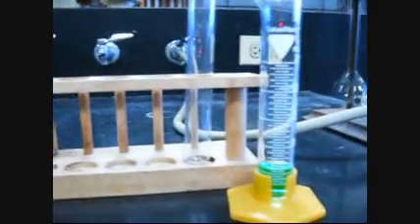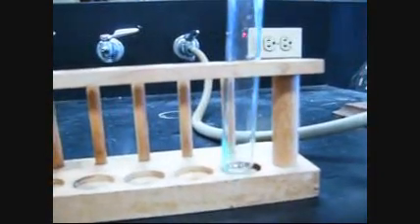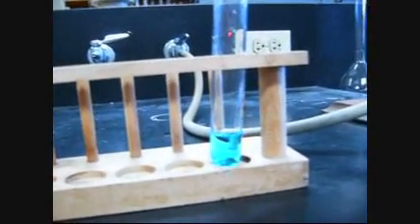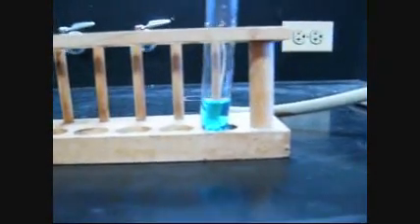Okay, this is the Evidence of Chemical Change Lab. We're going to start with 5 milliliters of copper sulfate solution. This is a blue solution. We add 5 mL of copper sulfate to a test tube.